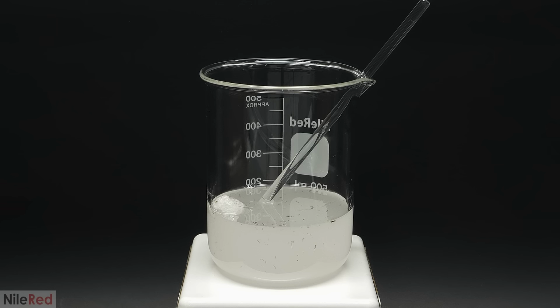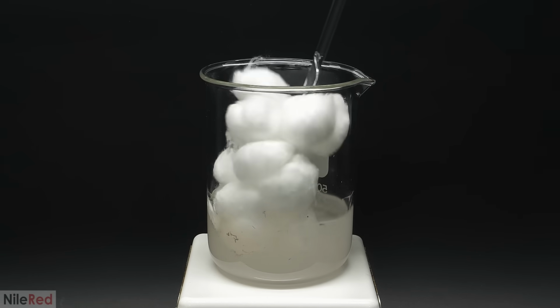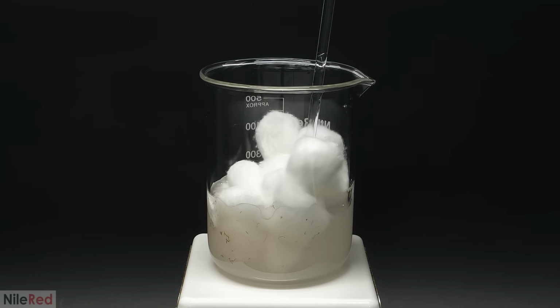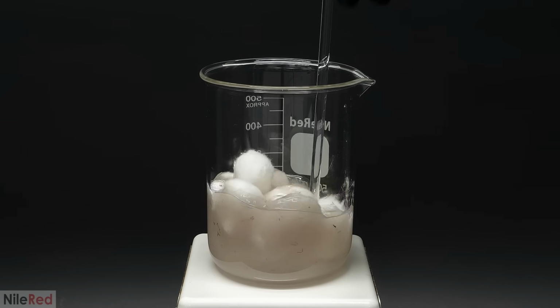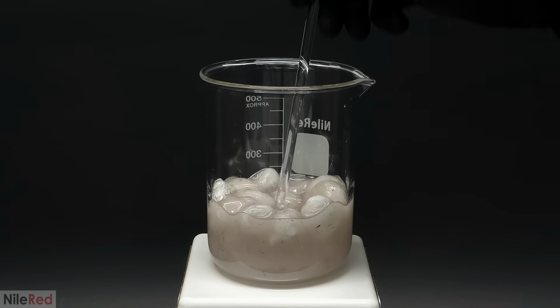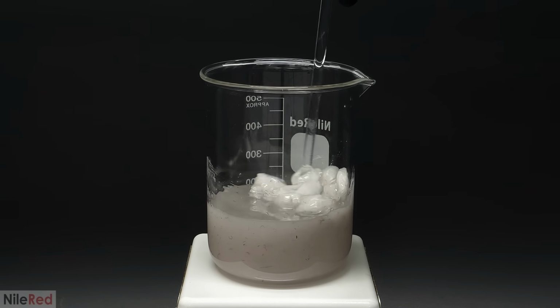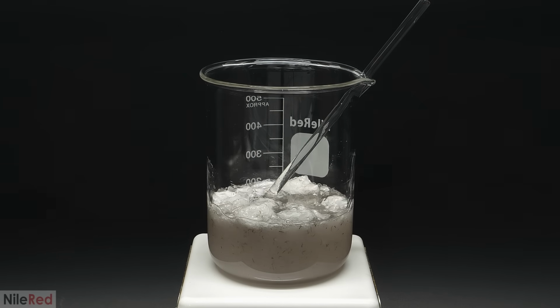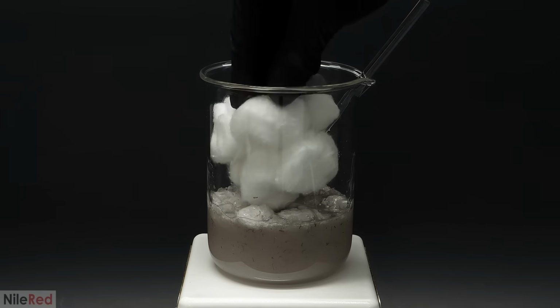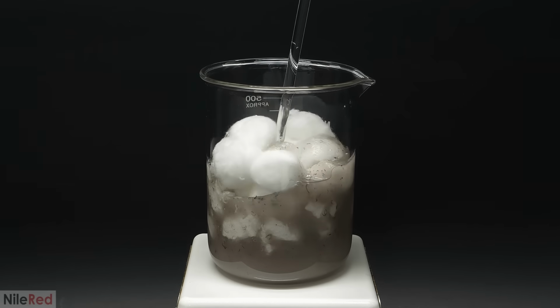to add the rest. So, I carefully loaded in a small handful, and it looked like it was barely gonna fit. At first, this was a bit concerning because this was only a small fraction of what I had to add. With just a bit of poking around and stirring, though, it slowly disappeared into the acid. I then continued adding the rest of the cotton, and I was honestly a bit worried that it wasn't going to be able to eat the whole bag.